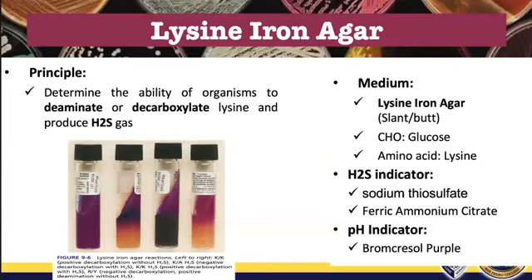Still, the reddening is due to the release of alkaline material, causing the change in color of the medium.